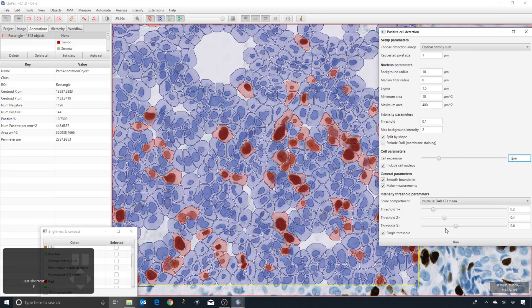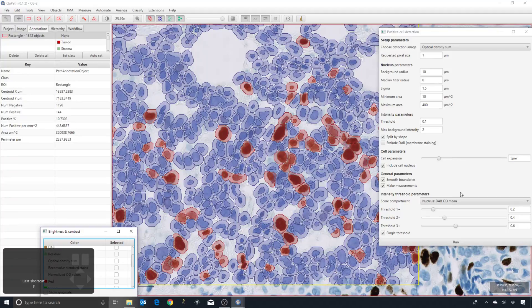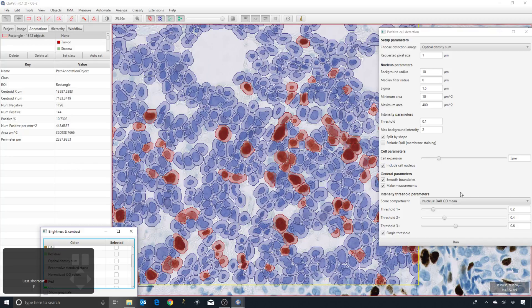The default is 5. This is a parameter you may want to change if you want to look at a biomarker located outside the nucleus, but you don't want to risk making measurements within neighboring cells.